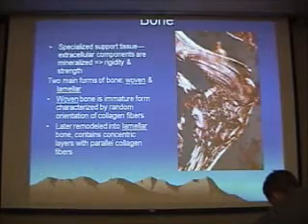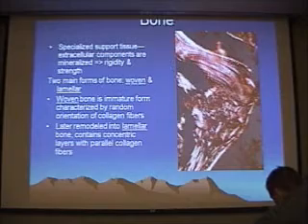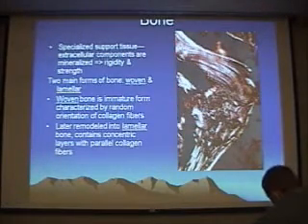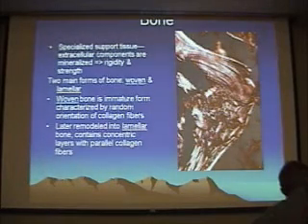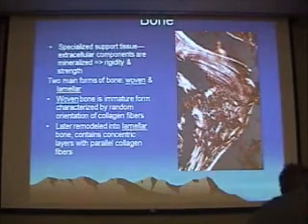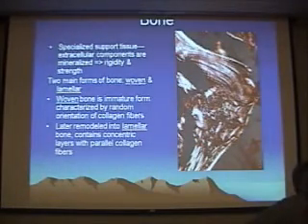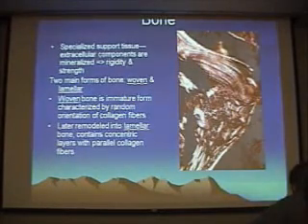After it is remodeled, the bone takes on a more uniform appearance, or a lamellar appearance, where you can see these concentric layers. Question? Do you call woven and spongy the same thing, or? You kind of can, sort of. Spongy bone actually undergoes remodeling also over time, but granted, it looks much more like woven bone. So if you call it spongy bone, woven bone, I'd probably let you slide.